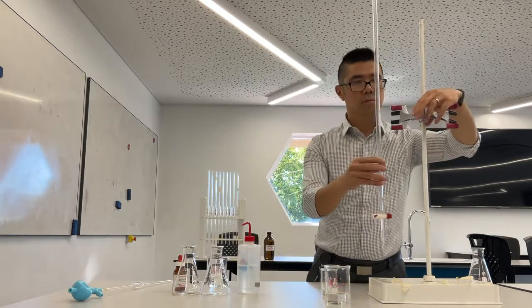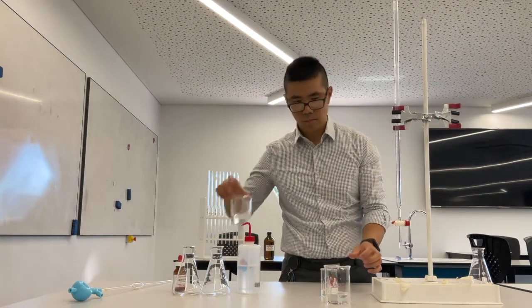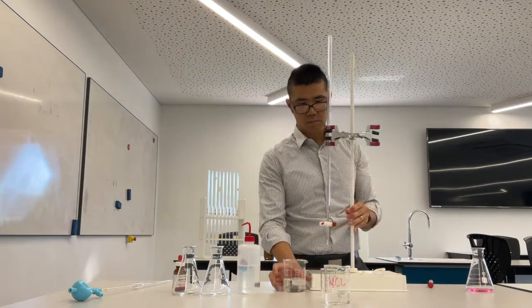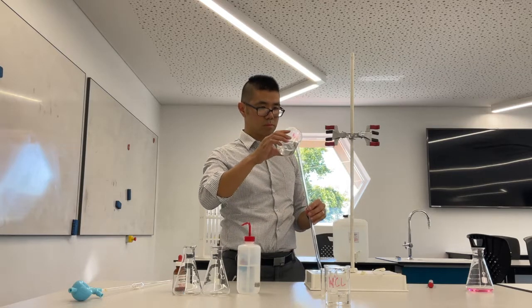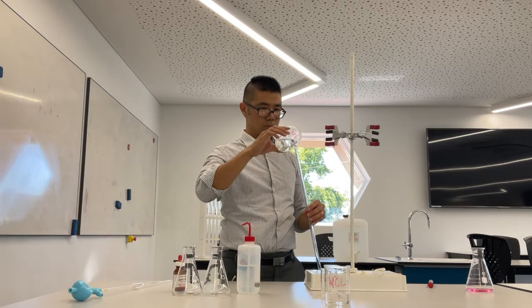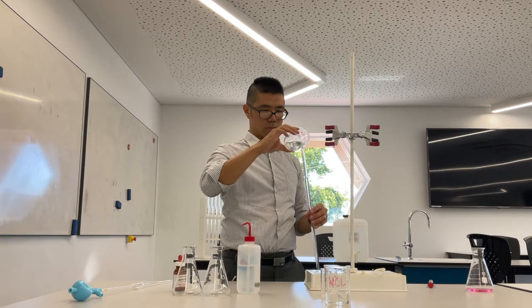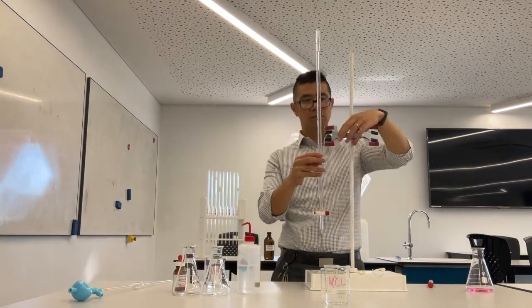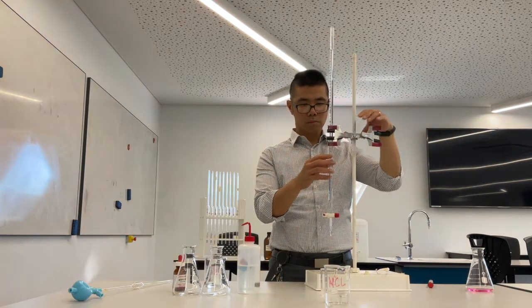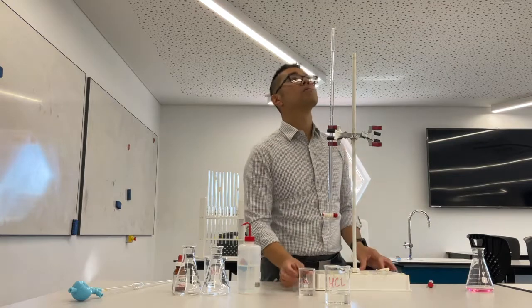Then put it back in the burette stand and refill it. Take it out of the burette stand and fill it below eye level — you can use a glass funnel if you need to. Remember you should fill it up to between zero and five mils. This first time you should fill it quite high to zero mils because there's no solution below the stopcock — that part is empty. So get your waste beaker out and allow it to flow through so that part is now full of solution.